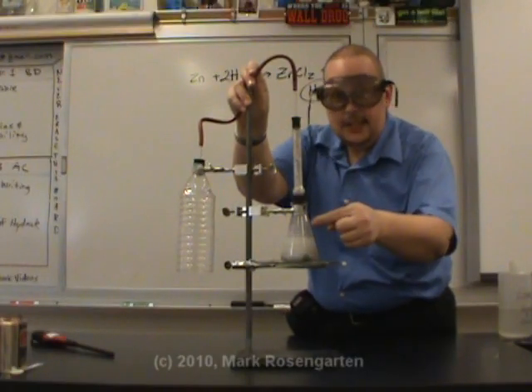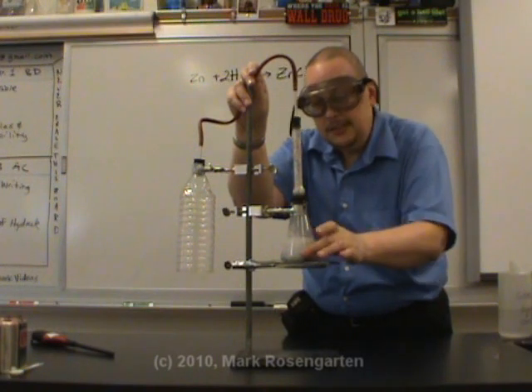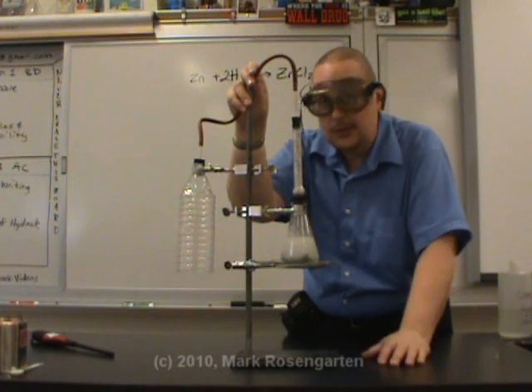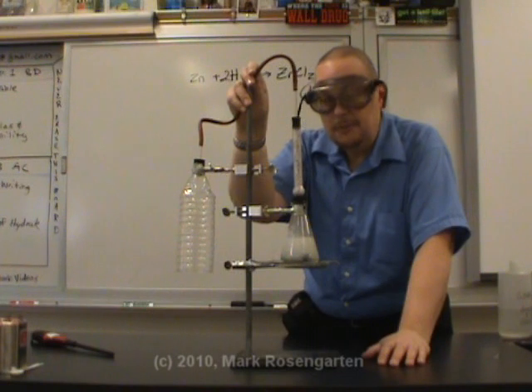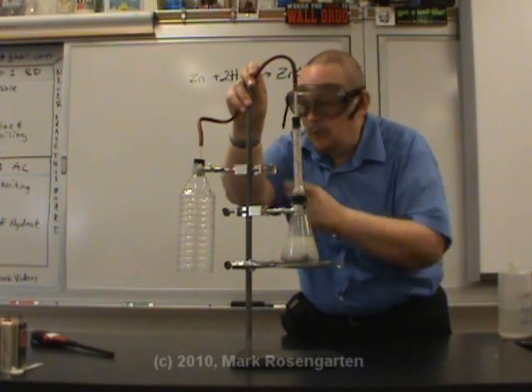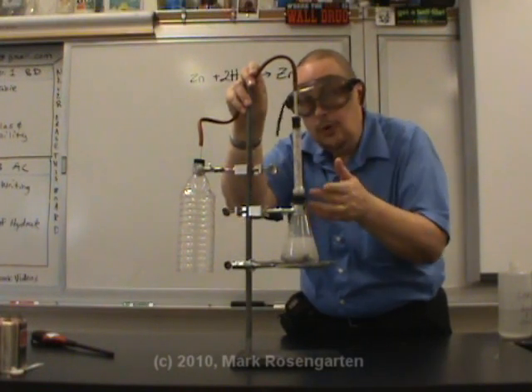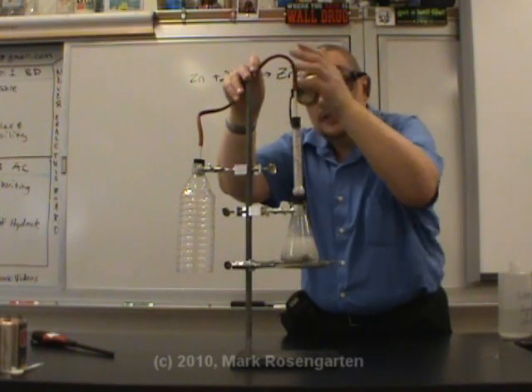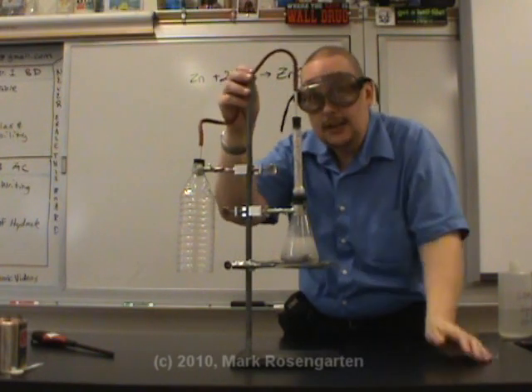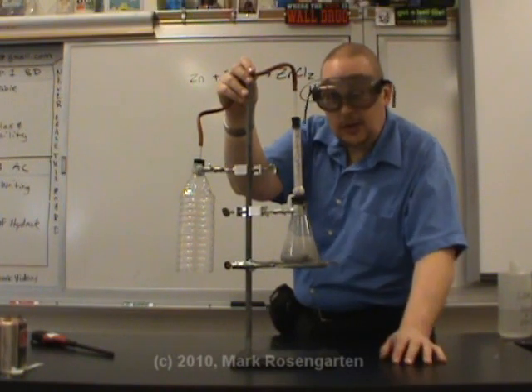We're starting to get condensation inside this flask. What that means is we're getting some water vapor — it's a very exothermic reaction, so the heat it generates is going to produce some water vapor, a little more than what we would normally expect. Since the only thing I want to come in through here is hydrogen, this drying tube will remove the water vapor so that the only thing that goes the rest of the way is the hydrogen gas. What you're seeing forming in here — this dark color here — is the zinc chloride.